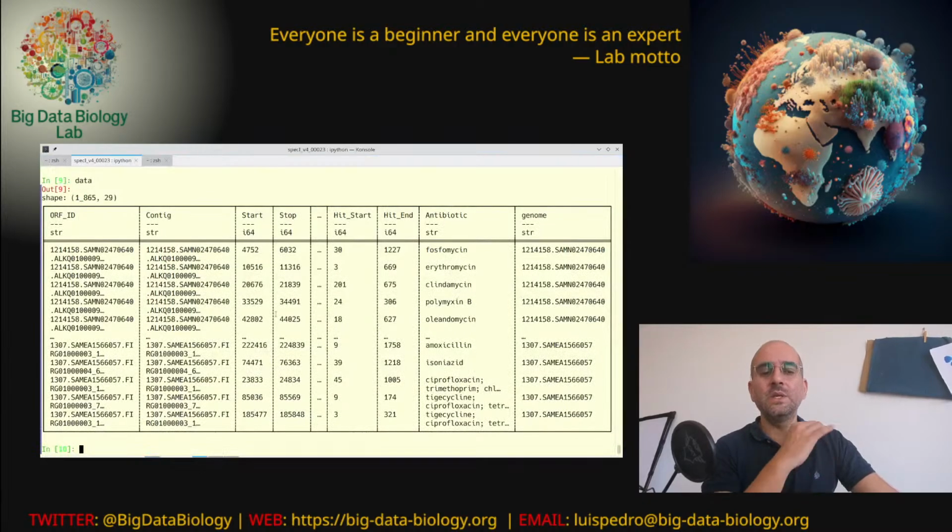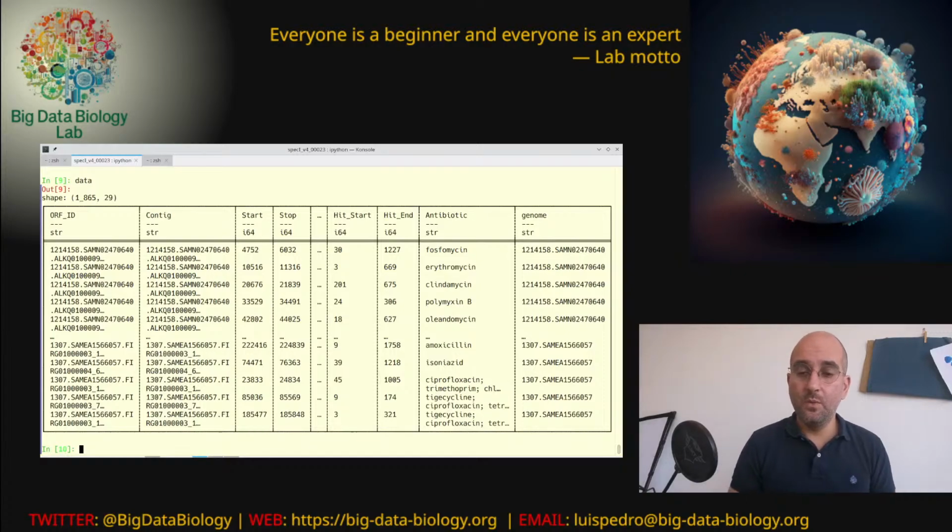My interpretation is that this was basically the same genome, probably a reference strain, and it just got sequenced multiple times, and each one is probably going to have its own little variations, but SNP-level variations, very small changes, which are incredibly important for certain studies, but maybe not so much for what we're doing here, where we're looking for larger scale structural variation, so presence of new gene cassettes, absence, that kind of thing.